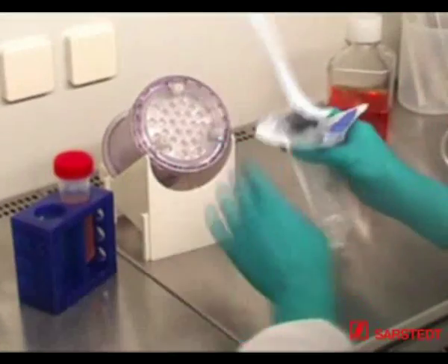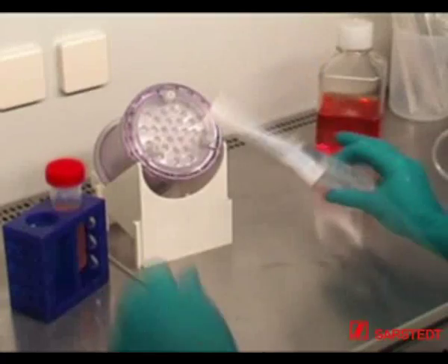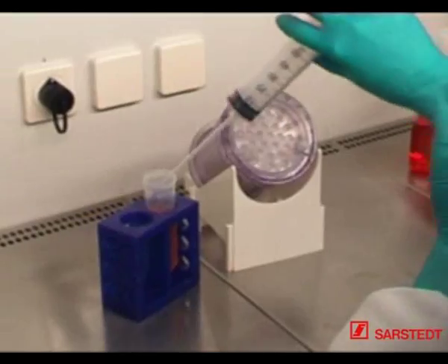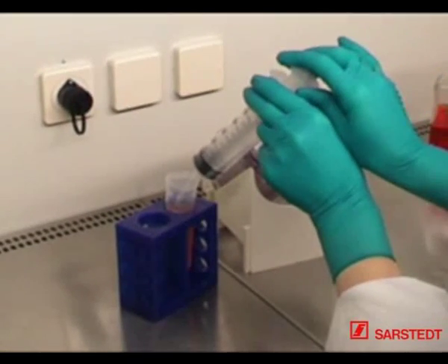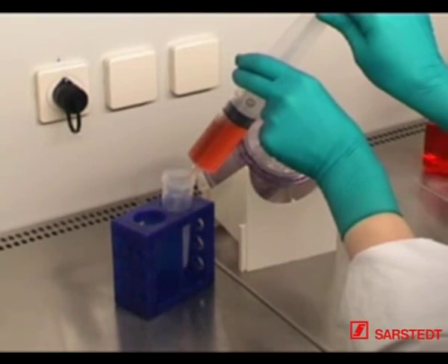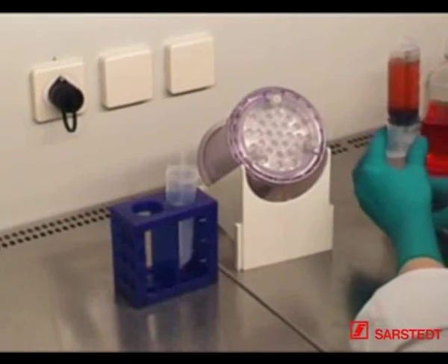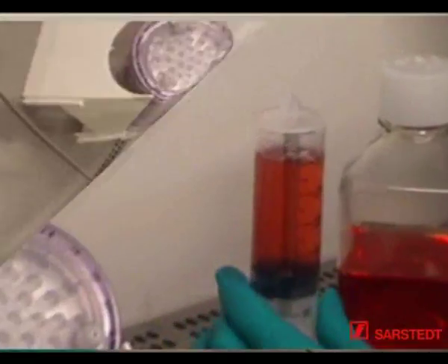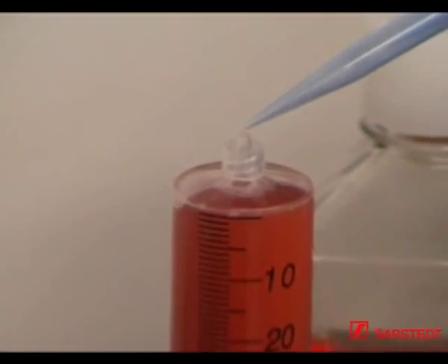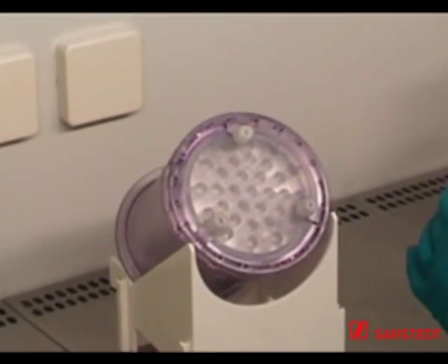Attach the 50 ml syringe to the filling tube. Slowly aspirate the prepared cell suspension into the syringe. Make sure to remove air bubbles from the syringe using a sterile swab or, as shown here, a sterile vacuum unit before filling the cell suspension into the production module.